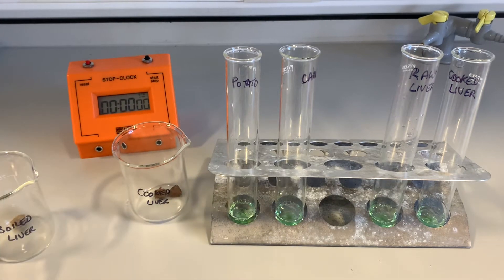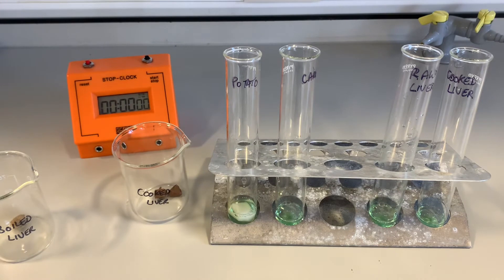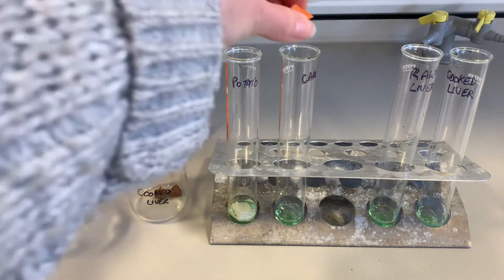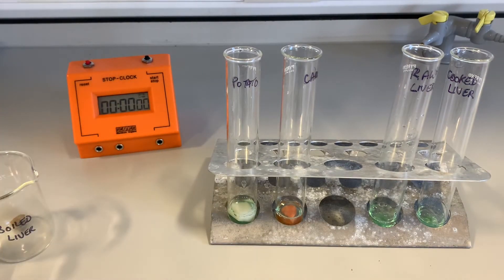To the other one I'm going to add some carrot, I'm going to add some raw liver to one, and some cooked liver to the other one. Then we're going to leave them for five minutes and come back and have a look at the froth. So I'm going to pop potato into this one and carrot into the one next to it.